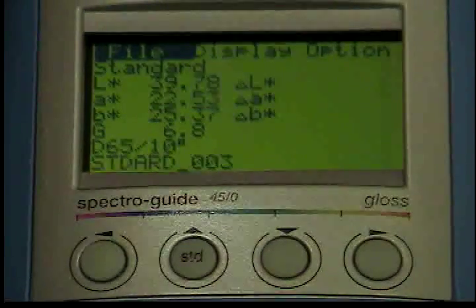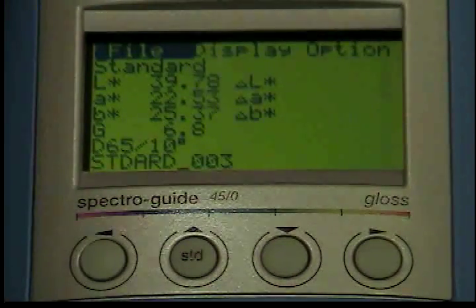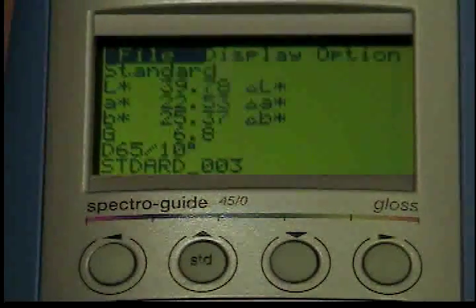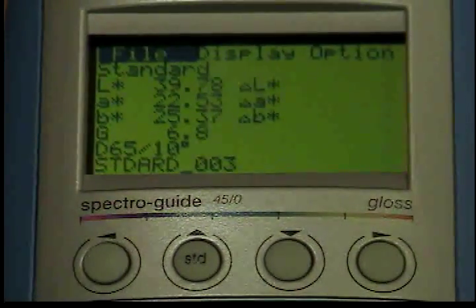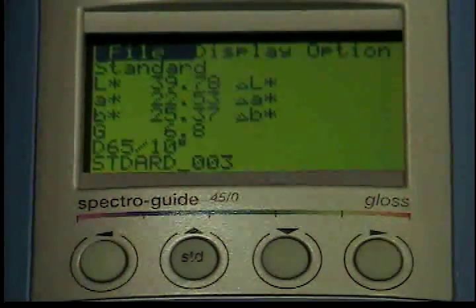If the auto save function in the option setup menu is on, readings will be stored automatically. There are three different ways to store a reading.